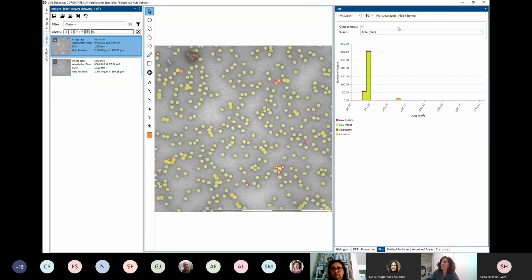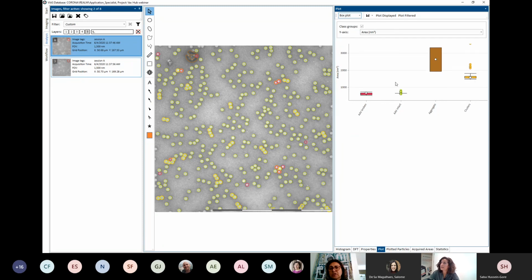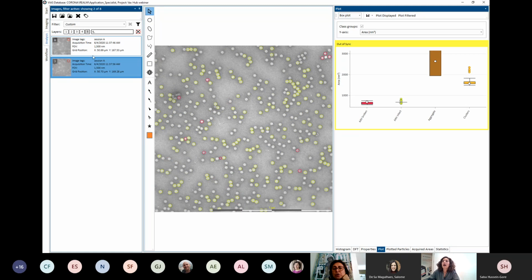You mean like this one? Well, I can't see the detail, but you didn't show this one, the one which actually was a genuine... I think it was the raw data. Well, what I consider as raw data rather than a distribution. The raw distribution of the particle. It has a peak and then it has a shoulder.